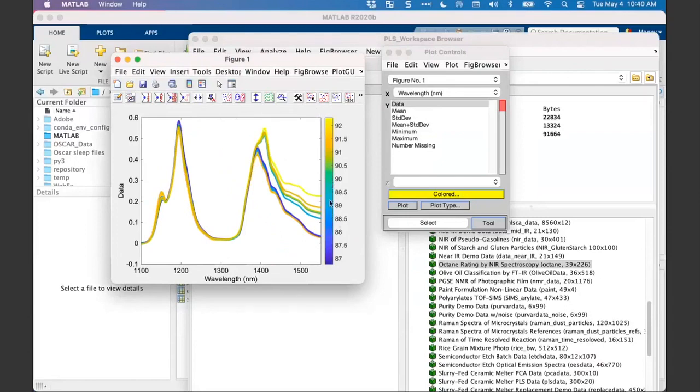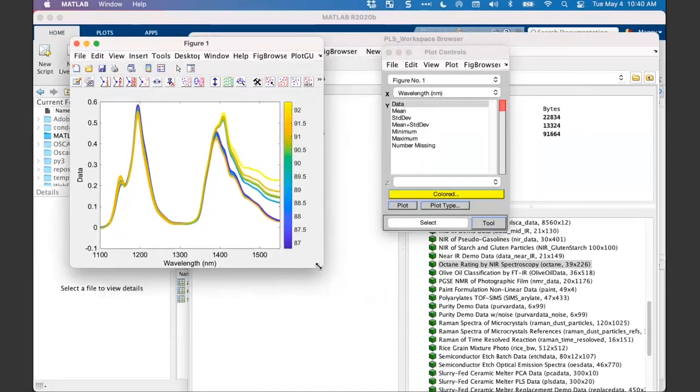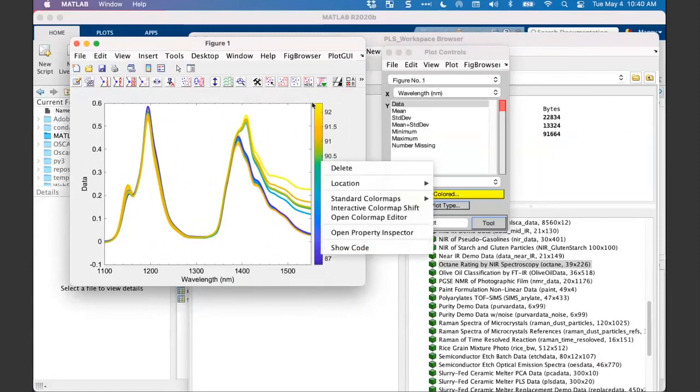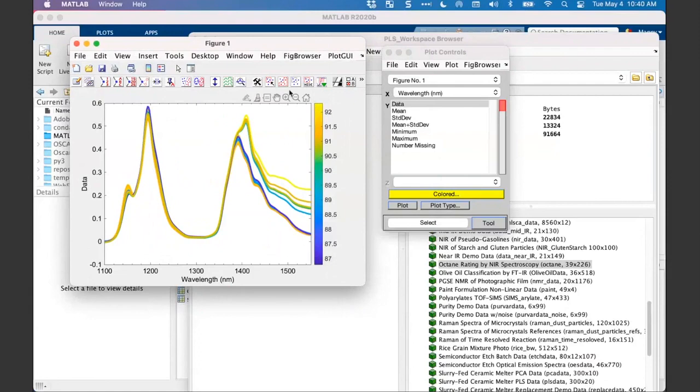I don't know if it's because maybe I have these numbers too big. No, it's because you still have zoom on, I think. If you just turn the zoom off... Oh, no, that's right. Yeah, right. So there you go. It is not nuanced.